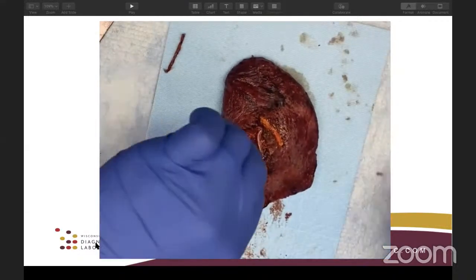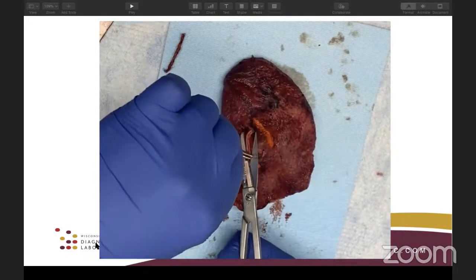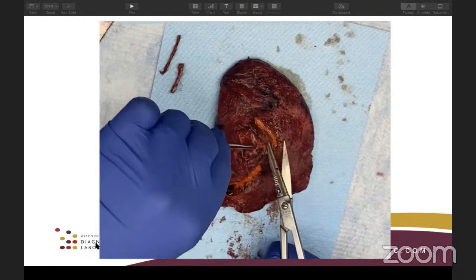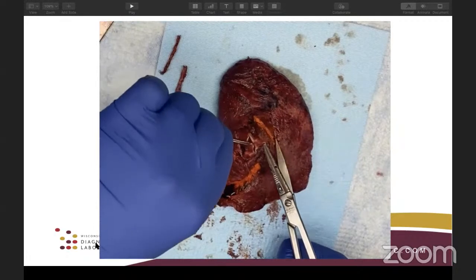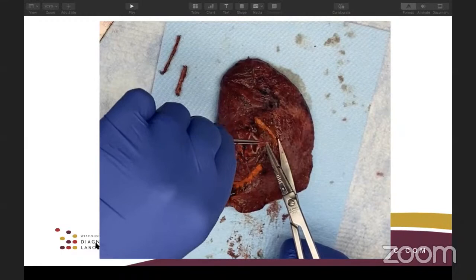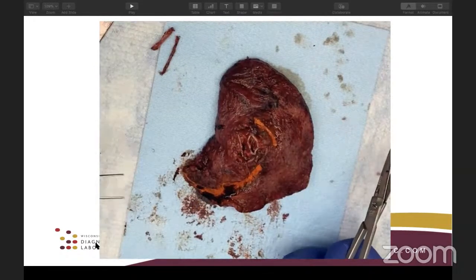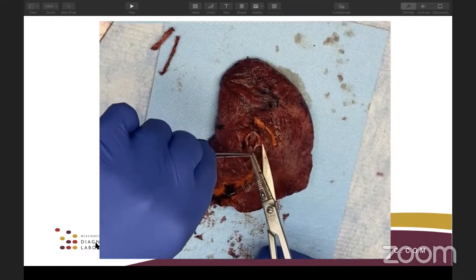Okay, now we're going to look at the bronchus and then at the vessel margin. So this is the bronchus first, and this also has a staple line on it. You might see staple lines on this. Sometimes it'll be sutures, but you handle it the same way. Shave off the staple line or the sutures. You can see I've got a couple left there. I'm trying to pull those out a little bit, and then I'll shave off the actual bronchial margin.